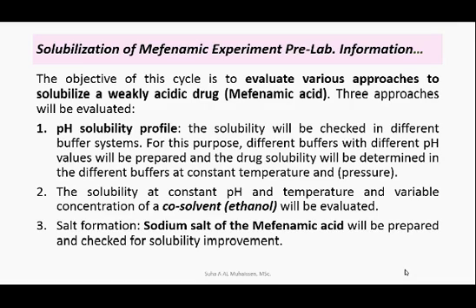First, pH solubility profile. The solubility will be studied in different buffer systems. For this purpose, 6 different buffers with different pH values will be prepared, and the drug solubility will be determined in these different buffers at constant temperature and pressure.